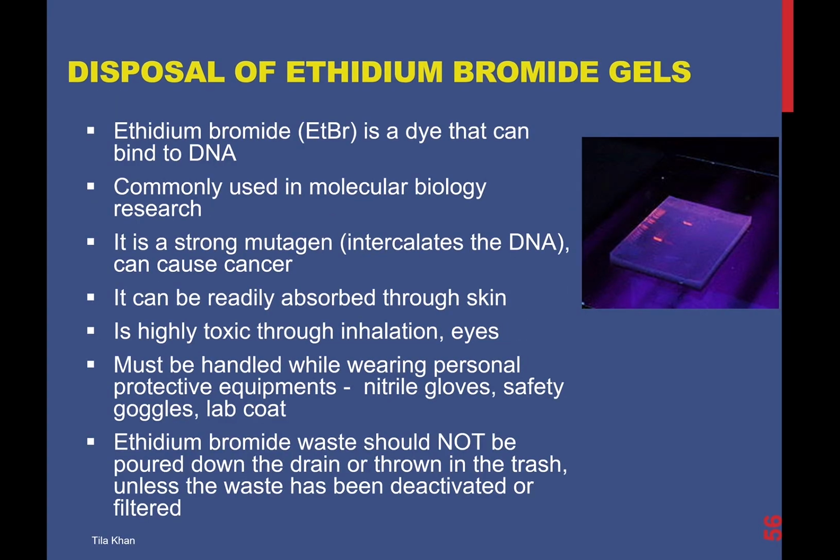Now I'll go over the disposal of two kinds of gels that are being used in molecular biology. One is ethidium bromide containing gels, and another is polyacrylamide gels. So ethidium bromide is a dye that can bind to DNA, and it is commonly used in molecular biology research in many of the labs in IIT Kharagpur.